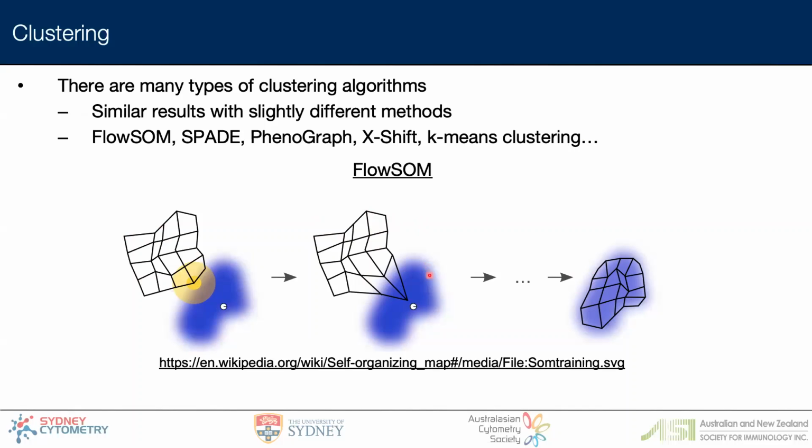It then goes into hierarchical clustering to create the metaclusters. But again, there are multiple different methods to go about doing the same thing. And if you're interested, Giovanna can give a 30-second k-means clustering example at the end of the talk, if you would like.